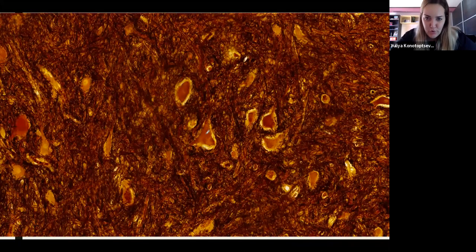This slide is to show you the alpha motor neurons, right? And you can see that there are some kind of cell bodies right next to it. These are going to be the Renshaw inhibitory interneurons, and you can clearly see that there are lots of axons going in all the different directions, so there is communication happening.